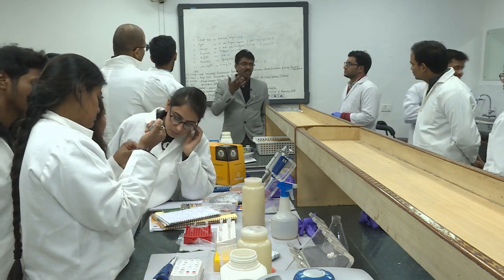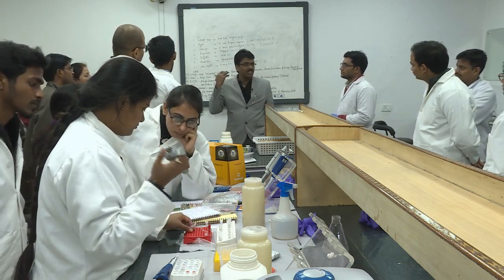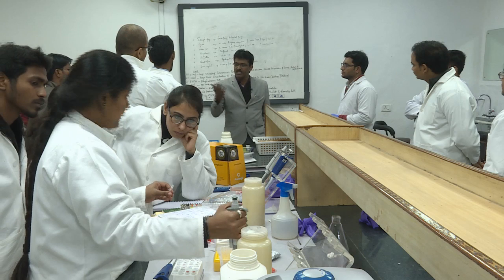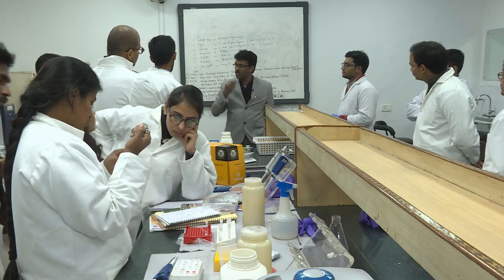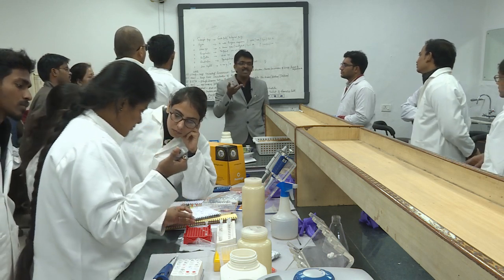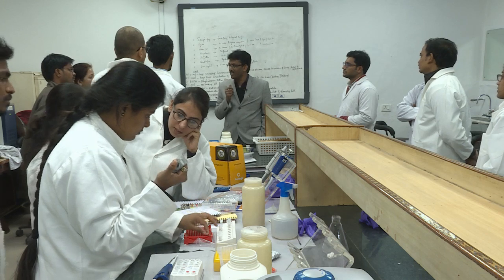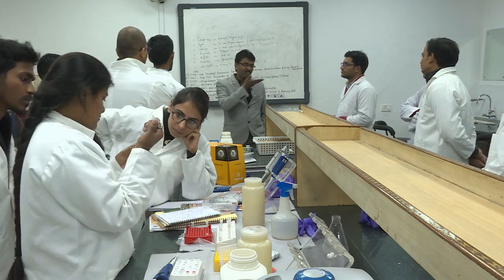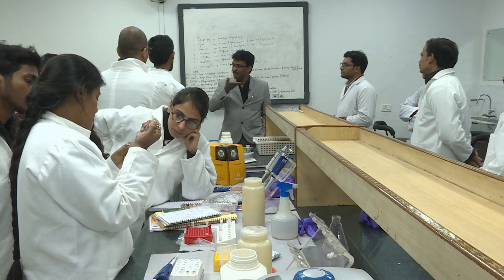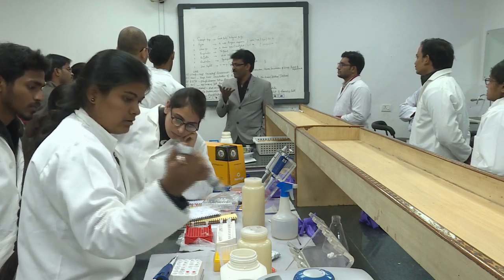Take out the fungal balls and go for sterility check, as well as of course it is coming from monosporidial origin. Then the mycelium is harvested and dried at 60 degrees Celsius for 3-4 days in a Petri plate. Then it's a dry weight, right?